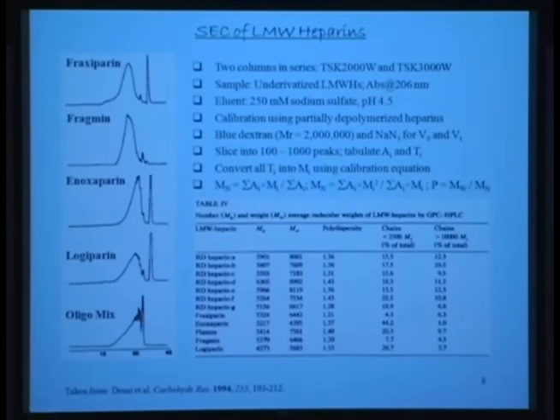If MW and Mn are the same, for example, if every chain, let's say we have fondaparinux, right? Every chain has exactly 5 residues. Yeah, 5 residues with exactly the same structure. If we do this calculation, you would find that MW will exactly match Mn, polydispersity of 1. All homogeneous species would have a polydispersity of 1.